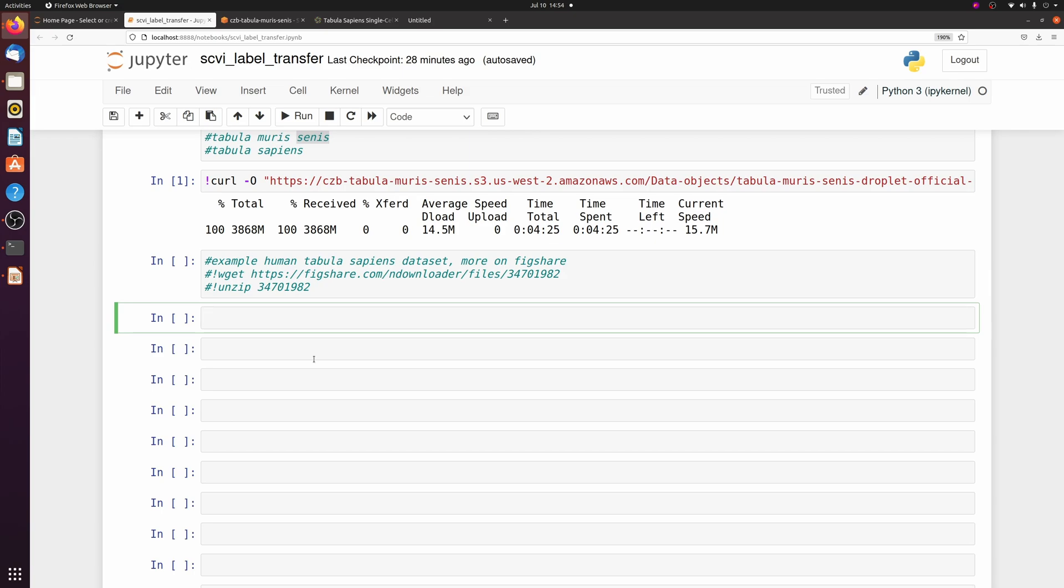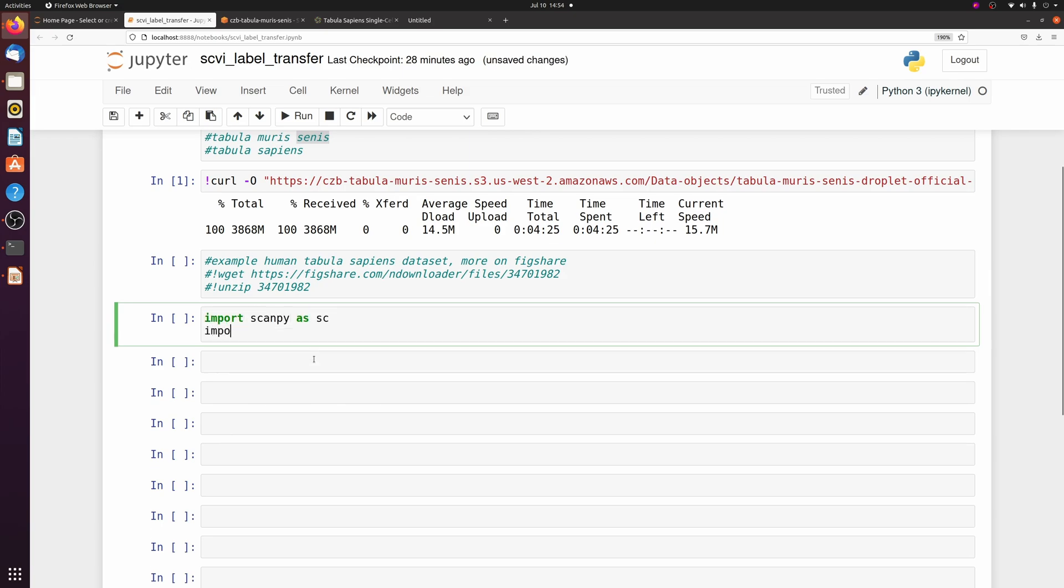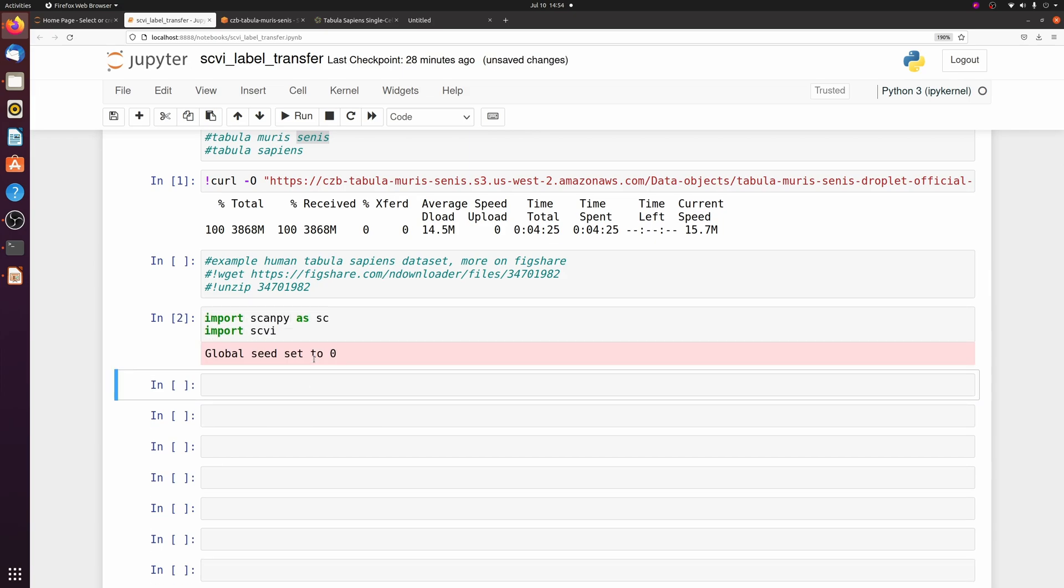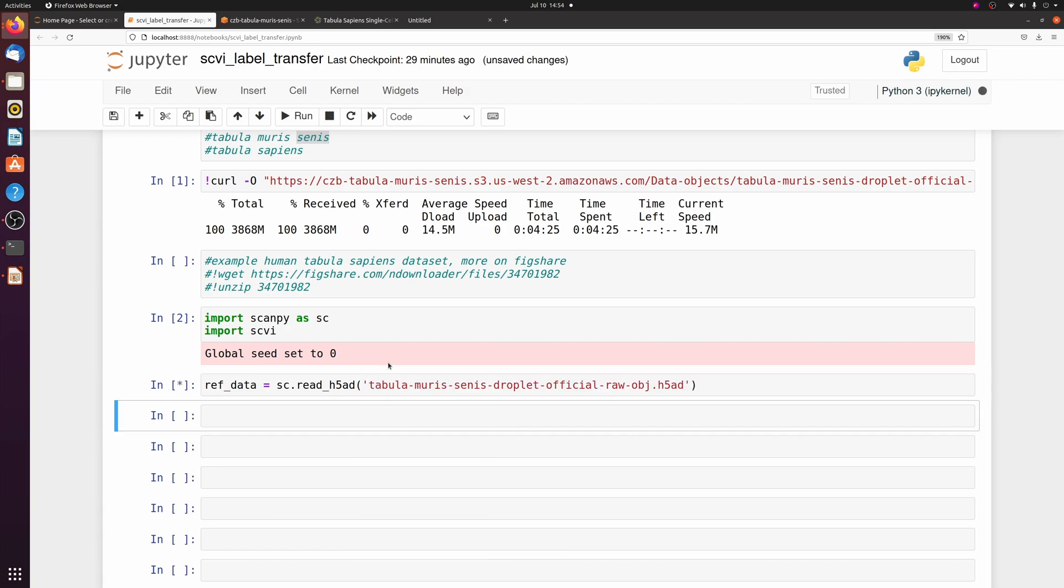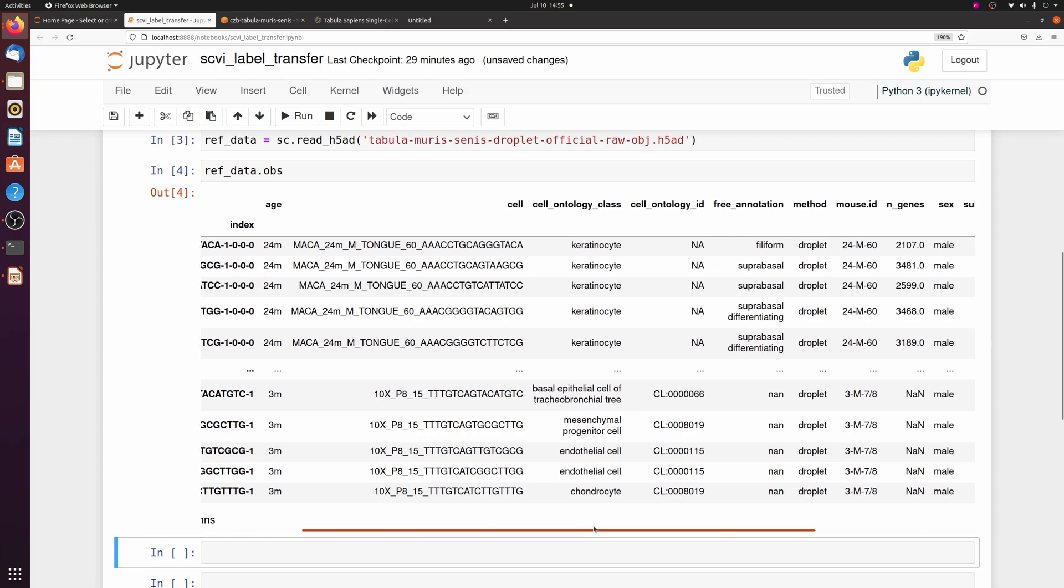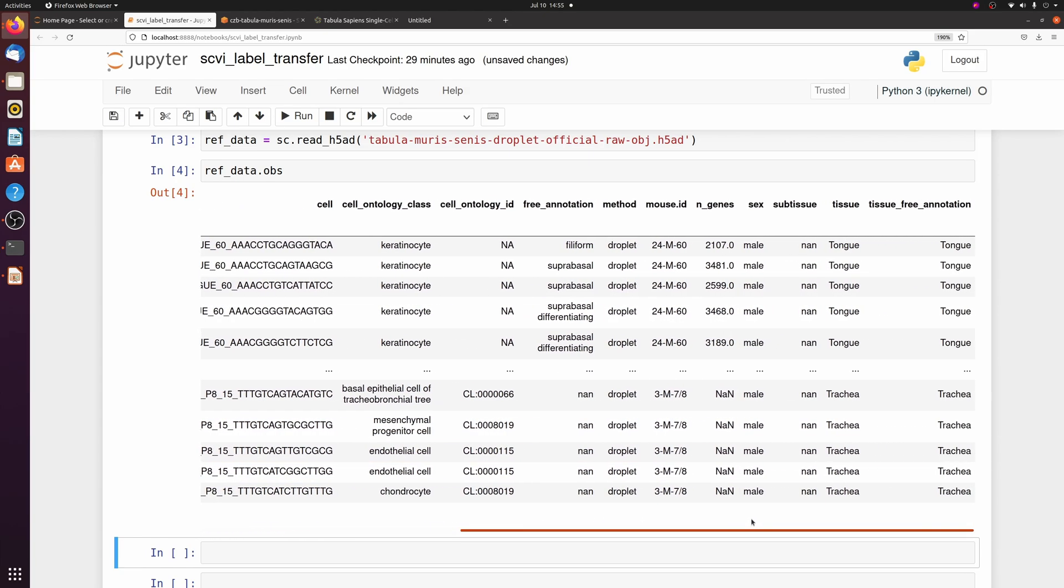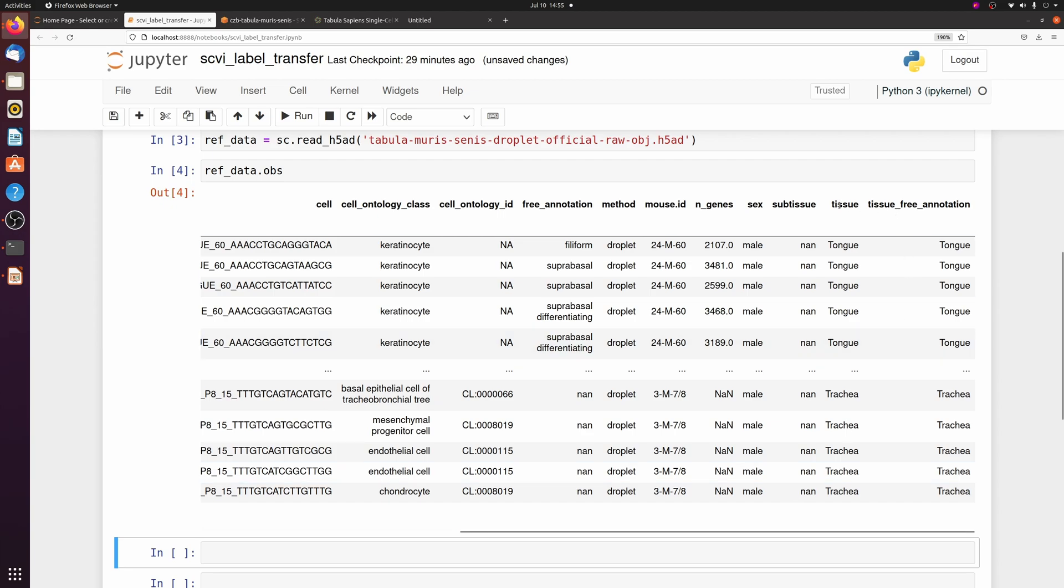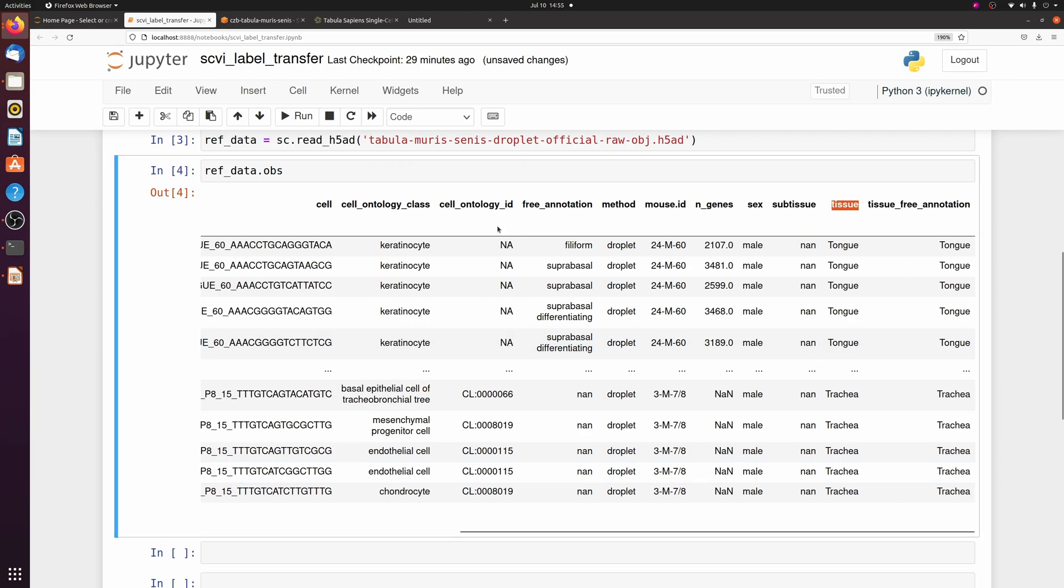Alright, now that that's finished downloading, we can import scanpy and scvi, and then we're just going to go ahead and load in the reference data.